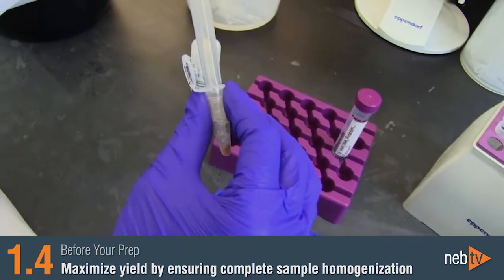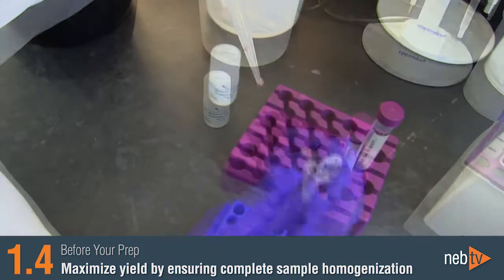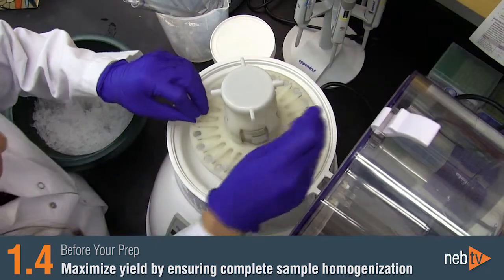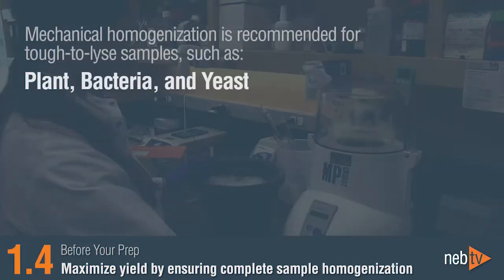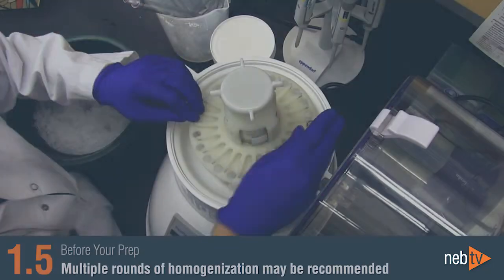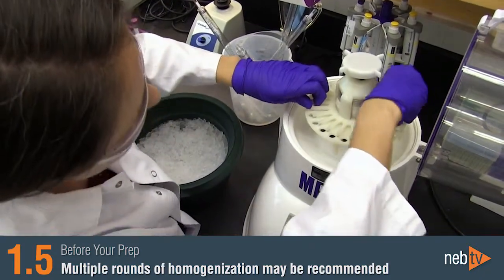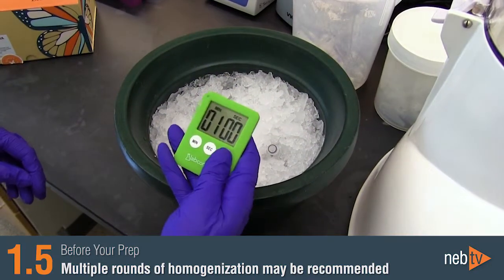Ensure that your samples are completely disrupted and homogenized in order to release all of the RNA and maximize your yield. Mechanical homogenization, for example, with a bead homogenizer, can boost your yields beyond those produced by proteinase K digestion alone when you're working with tissue. Mechanical homogenization is also recommended for tough-to-lyse samples such as plant, bacteria, and yeast. When using mechanical lysis and homogenization, multiple rounds of homogenization may be recommended. If you do use multiple rounds, place your sample on ice for approximately 1 minute in between rounds to prevent your sample from overheating.